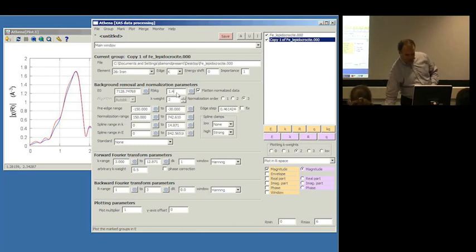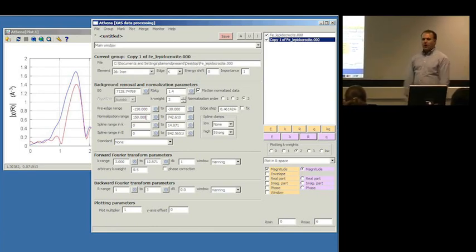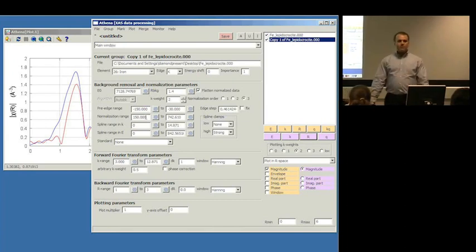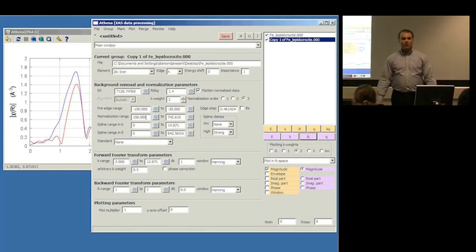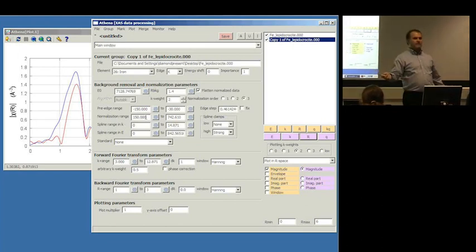I'll step up a little bit more and plot it again. And now at 1.4, bad things start to happen. So is 1.0 better or worse than 1.2? I'm not really certain right now. 1.4 is certainly wrong. 1.0 is probably a fairly safe value. 0.8, 1.0, 1.2 did basically the same thing down here. The details were slightly different, but it did basically the same thing.